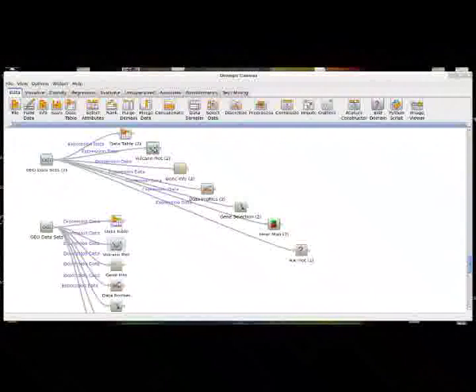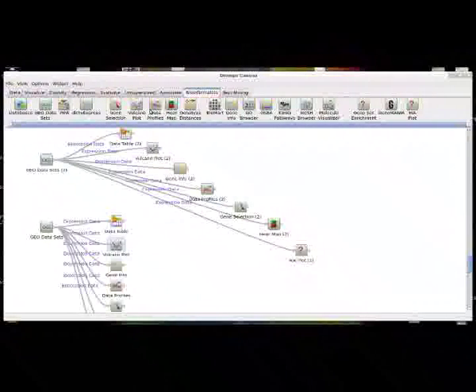But I'm not an expert on volcano plot. You can go to Wikipedia and there's a very nice article on it that I have not yet mastered. But the problem with this whole bioinformatics add-on is there isn't actually any documentation for any of these widgets. So this should be one of the first examples of that. And I guess it won't be the highest level, at least in the case of volcano plot.